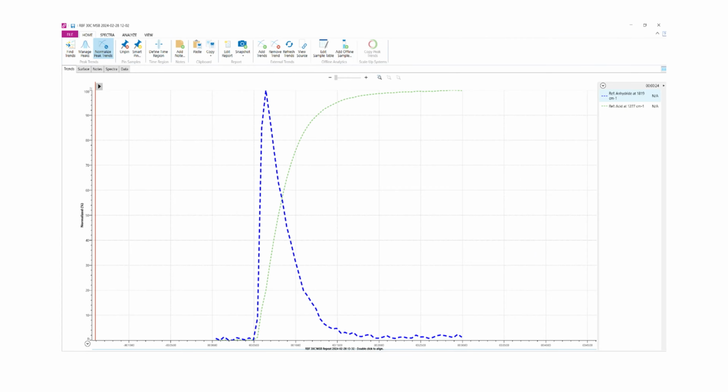Next is an example of the same hydrolysis of acetic anhydride when correctly executed in a round-bottom flask. We used ReactIR spectroscopy to show concentration trends for the reactant, acetic anhydride, in blue, and product, acetic acid, in green.